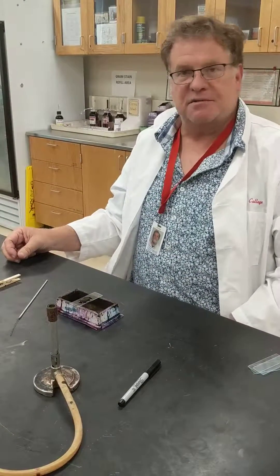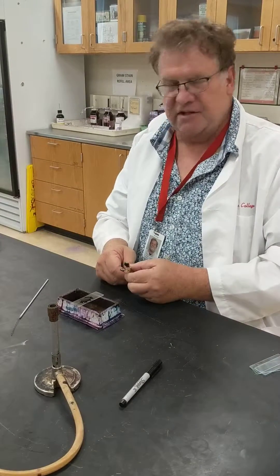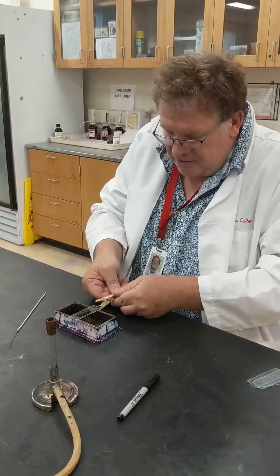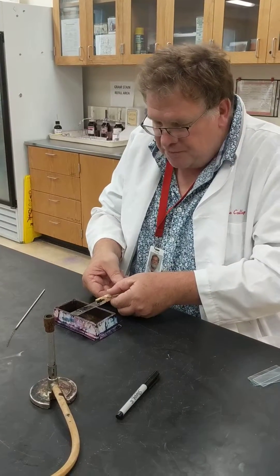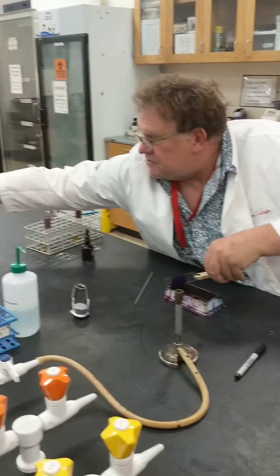Once you flood the stain with crystal violet, you count — 1,000, 2,000, 3,000 — all the way up to about 30,000 (approximately 30 seconds). Then what you do is pour off the stain.